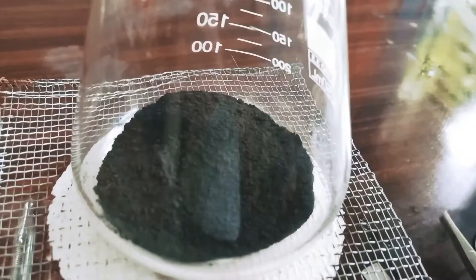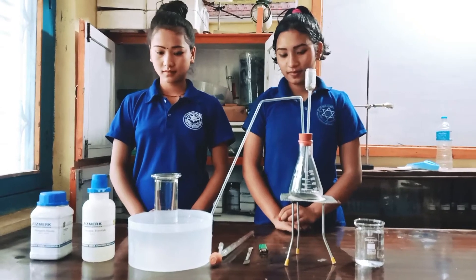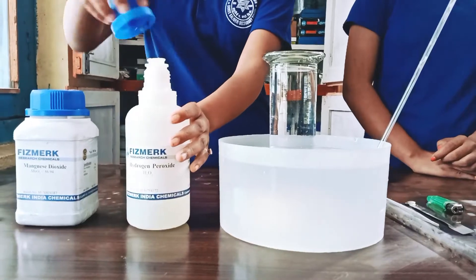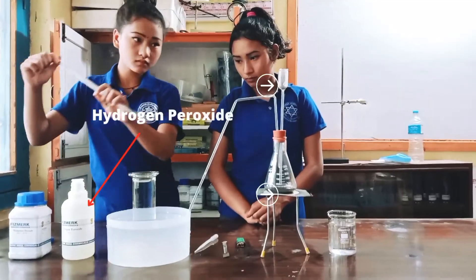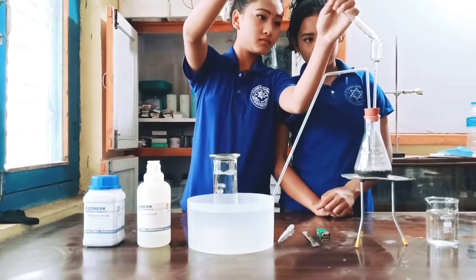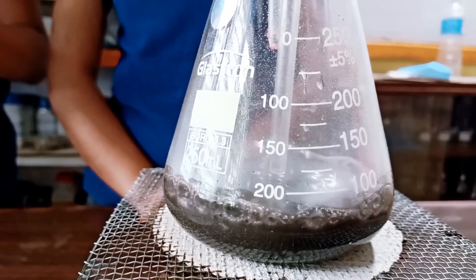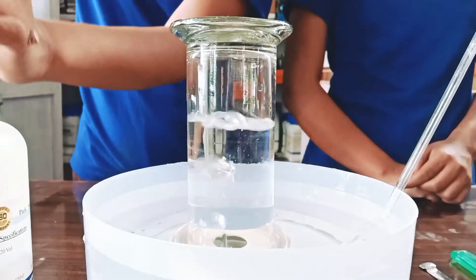For the experiment, first of all the apparatus are arranged properly. To start the experiment, hydrogen peroxide is poured into a conical flask containing manganese dioxide and water with the help of a thistle funnel. Then inside the flask, the decomposition of hydrogen peroxide takes place in the presence of manganese dioxide, and oxygen gas is liberated.